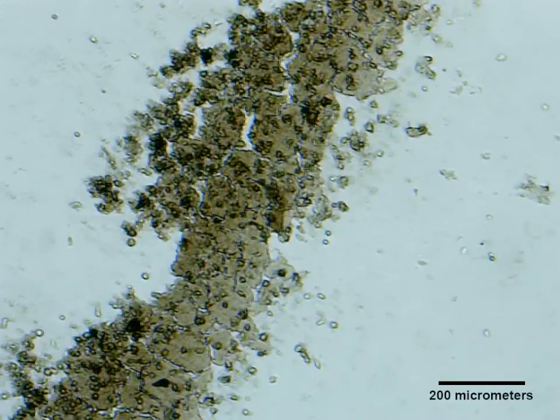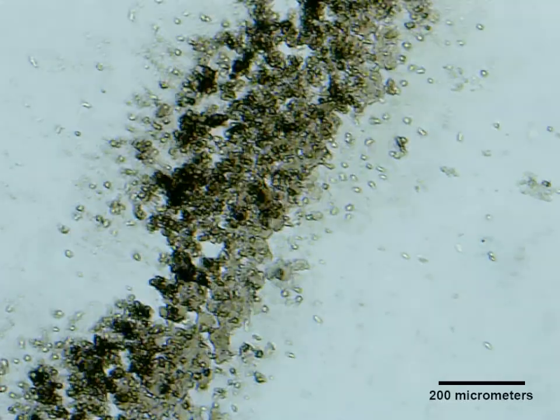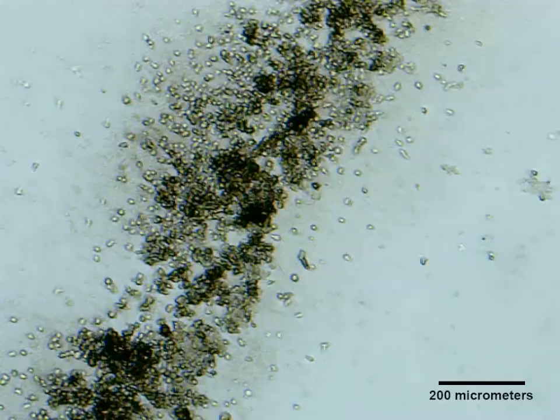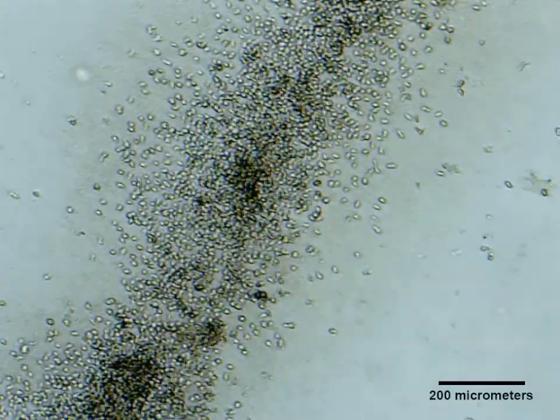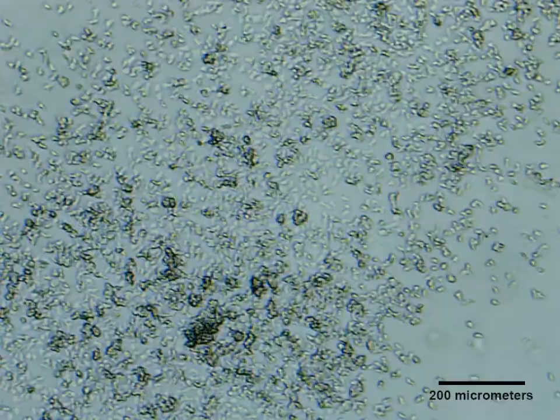Now we're seeing the biofilm being swarmed by amoeba. These amoeba are called dictees, and they live in the soil pretty much around the world. As the biofilm disintegrates, the amoeba multiply.